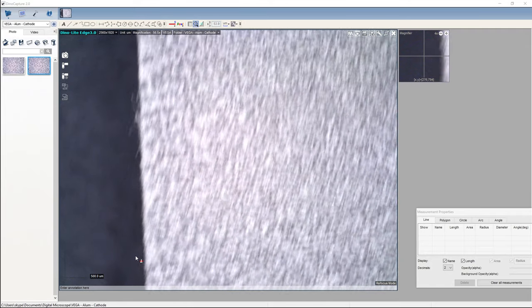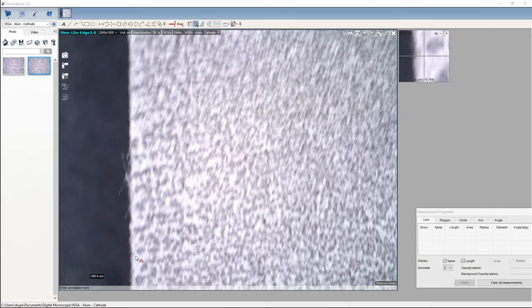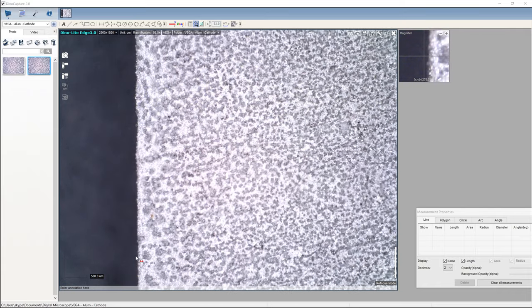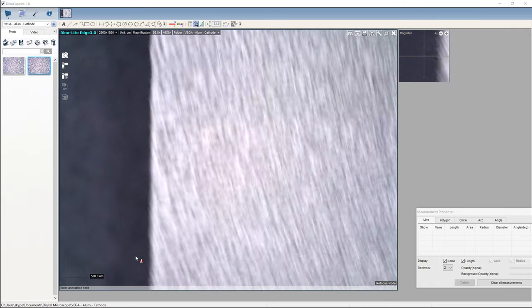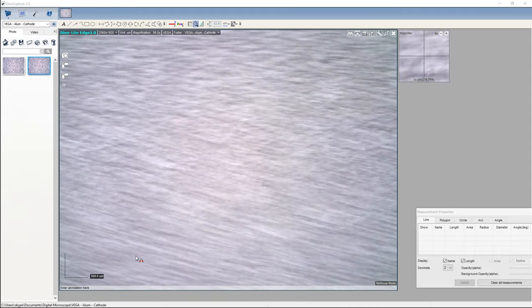And this is a very interesting finding here. So on this edge, we are seeing a kind of gap where there aren't many formed. This, I think, will be very important later. Look, all the way down that edge, there is a lower density of them, even though just inside, there appears to be a higher density. Okay, but they are bigger, the ones inside.